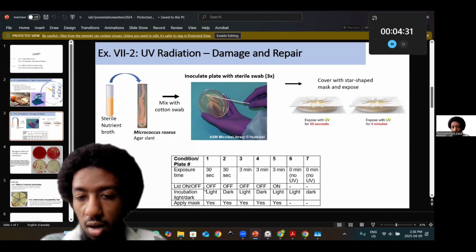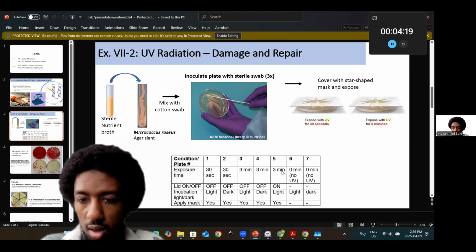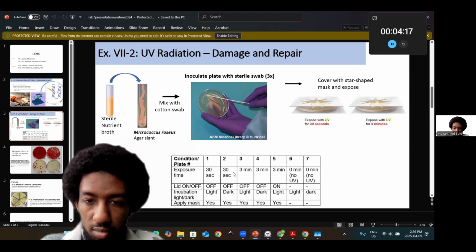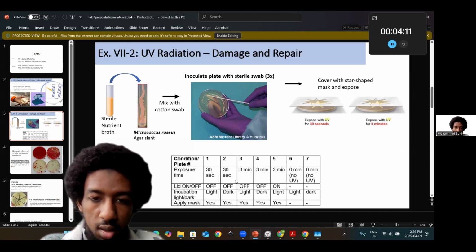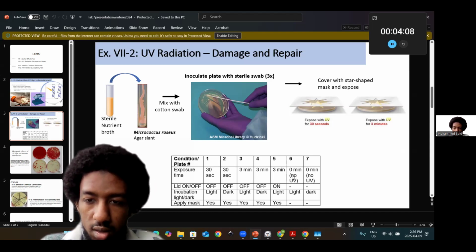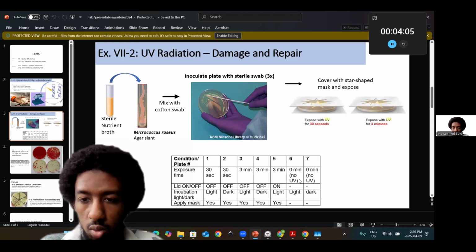And so you had the lid off, direct exposure, lid on, was essentially preventative, almost like a control without direct exposure. Even though they differed across time, one extension could even be having the 30 seconds lid on treatment, though technically you wouldn't expect too much of an impact. Nonetheless, you had the different treatments, the 0 minutes indicative of no UV.